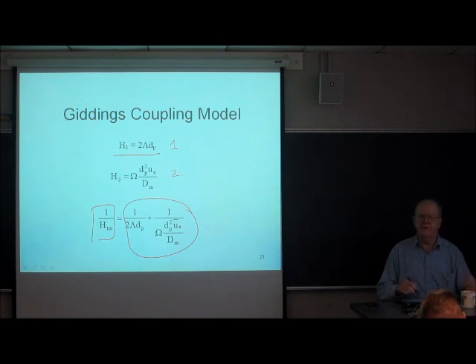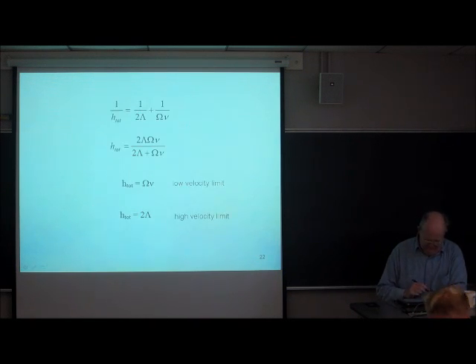Now even this is a bit messy to write. So a little while later, when John Knox had invented the reduced parameters, you can apply the reduced parameters.